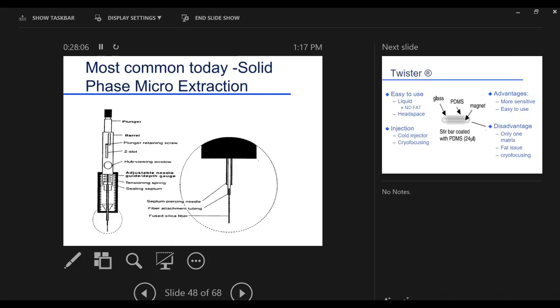And this is a special kind of odd-looking syringe. Because it's set up in a way that there's a sheath down here, a protective sheath. And there's a plunger that comes all the way down through that sheath and it can actually extend it into the sample. So I guess that showed up a little better over here. So this bottom part, this extended part here. So what we can do is we can take this syringe, we can push it into a bottle that has our flavor, our food, whatever it is. And then we push this center plunger out. This is coated with an absorbent. So now any volatiles in my sample start to concentrate onto it.